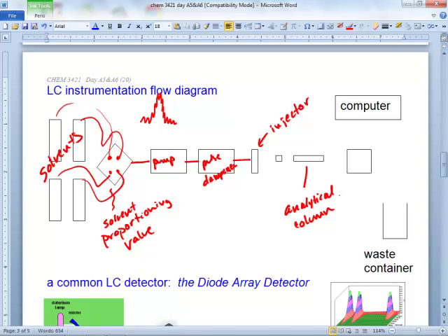It's really competitive to make these nice machines. So they want low volume, minimize that zone broadening. They've done it to the extreme. To connect all this stuff, it looks like a wire. But it's their tubing. So this stuff is really, really easy to clog, because you're injecting whatever you want. You know, there's narcotics, blood, whatever you're injecting on this machine, it's pretty dang easy to clog. And if this costs $600, no.